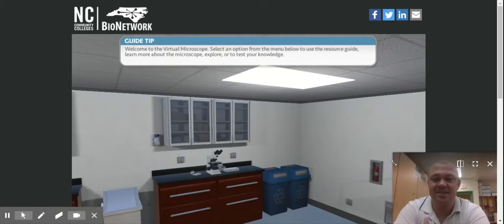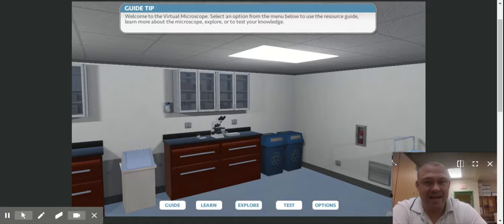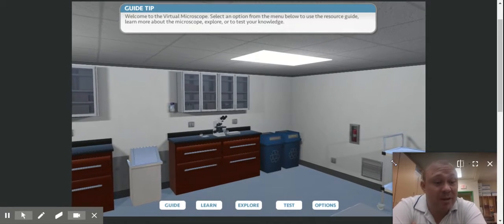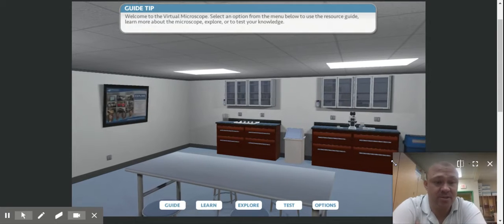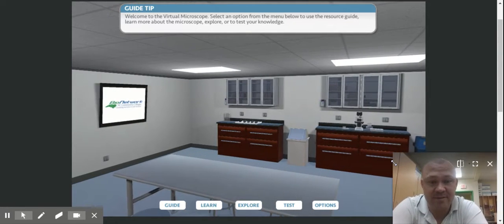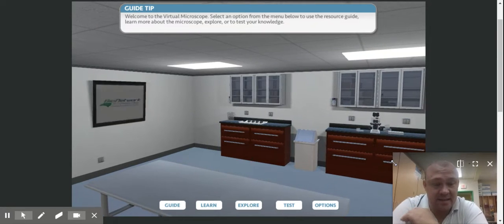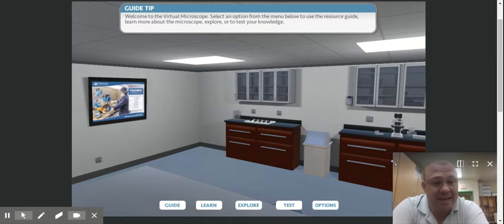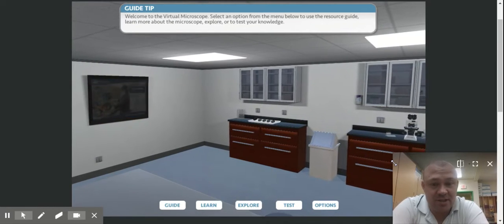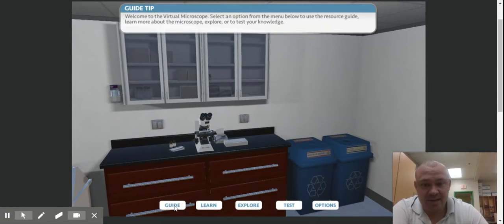Hey guys, it's Mr. Haas here, and I want to walk you through this online virtual microscope that we have here. I know it's not the same as being in class, but with you being virtual, this is the closest we can get to the microscopes that we have in class. So this is a very lifelike microscope activity. So you're kind of on your own here, but I do want to share a few things with you. There are some buttons here that can help you.